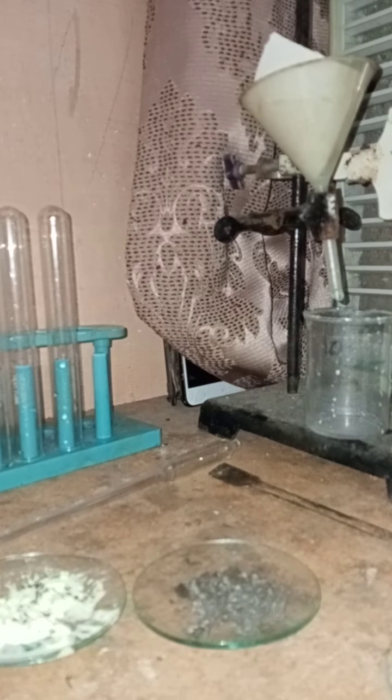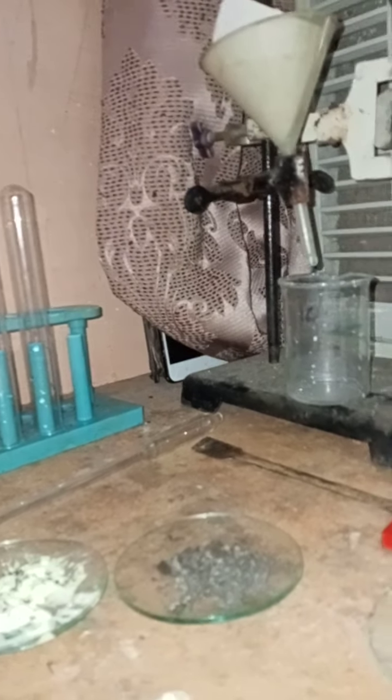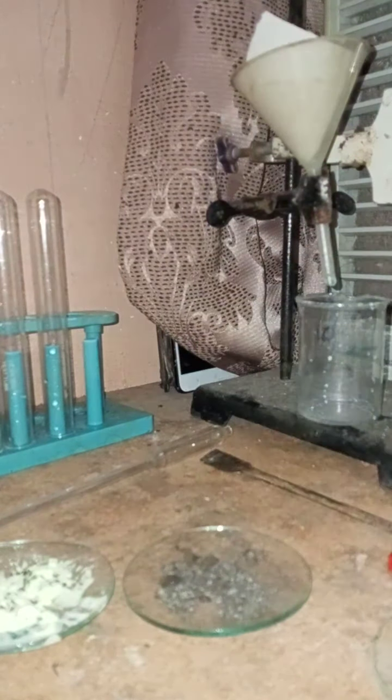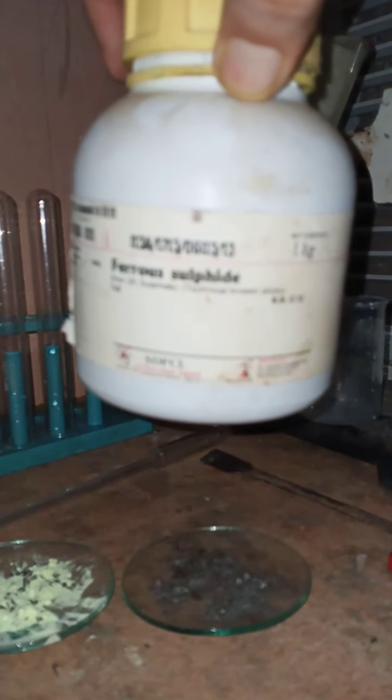In watch glass A we have sulfur powder as well as the iron filings. Now we are going to perform a few tests so that we can really understand the difference between the compound and mixture. Here you can see that when I have heated the iron and sulfur powder, a new compound is formed. This compound is known as iron sulfide, which is also known as ferrous sulfide.